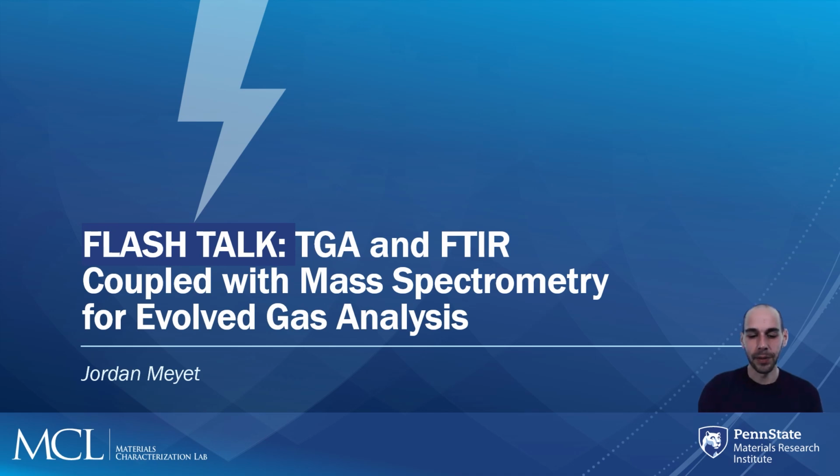Hi everyone, my name is Jordan Meyet from the Material Characterization Lab at Penn State. Today I will be discussing the coupling of thermogravimetric analysis and FTIR spectroscopy with mass spectrometry for evolved gas analysis.